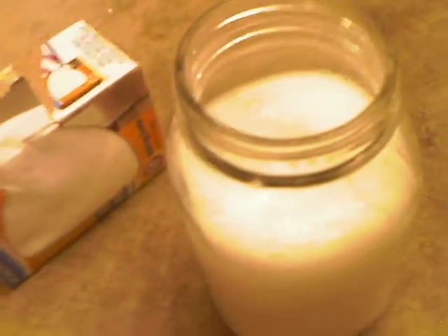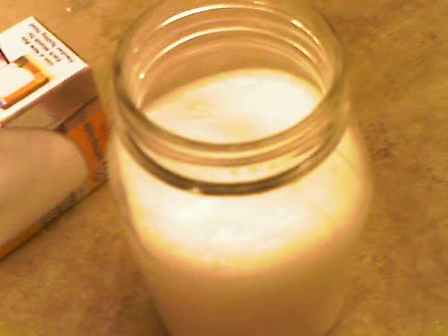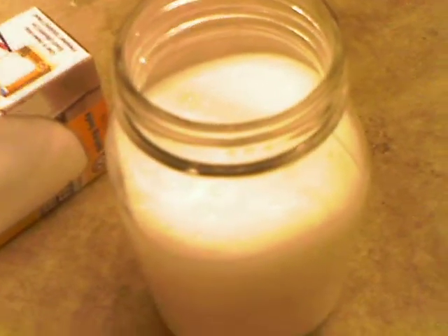It's a gel-like compound. Make sure you have a tall container when you do this. It's a very high viscosity.